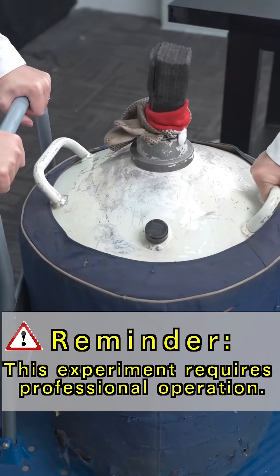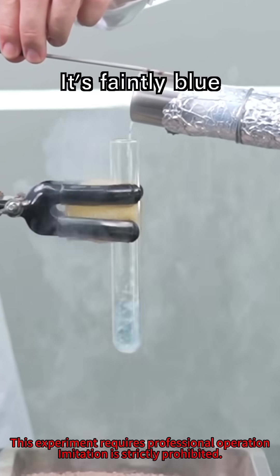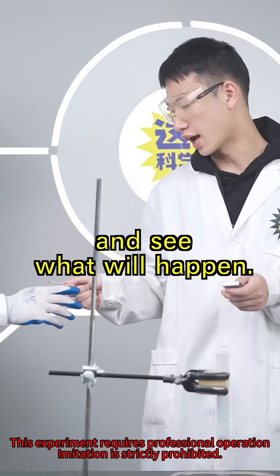Reminder: this experiment requires professional operation. Imitation is strictly prohibited. This is liquid oxygen — it's faintly blue, as cold as minus 183 degrees Celsius. Let's drop a lit matchstick into it and see what will happen.